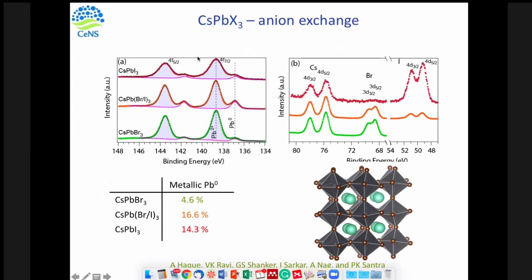What are the detection levels for a particular element for this technique? Is there any direct way to answer it? Do you have a ballpark idea, let's say approximately in atomic percent? See, approximately in atomic percent, I think 1 or 2%. More than that, maybe tough.